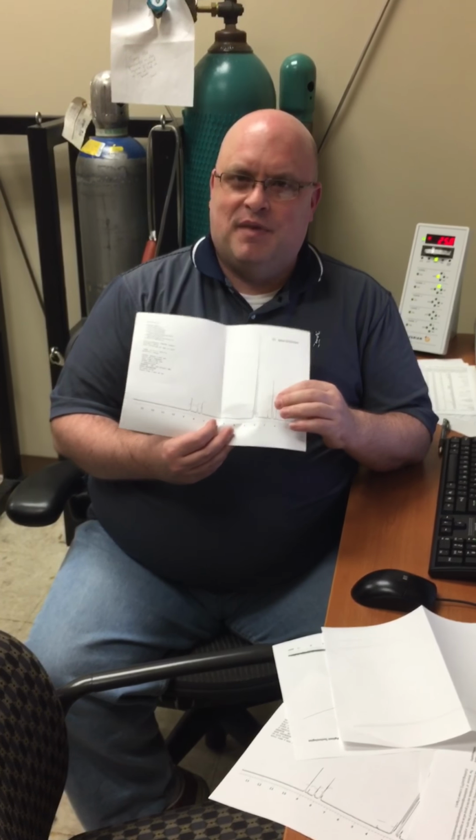Well, acetonitrile is not actually a bad ligand. It can actually coordinate to the cobalt as well. And so that may be some of the reason why things are falling apart a little bit, maybe displacing the pyridine or something. Okay. All right. So if you look at other people's and they have something around 0, that means they had TMS in their solvent, which is fine.